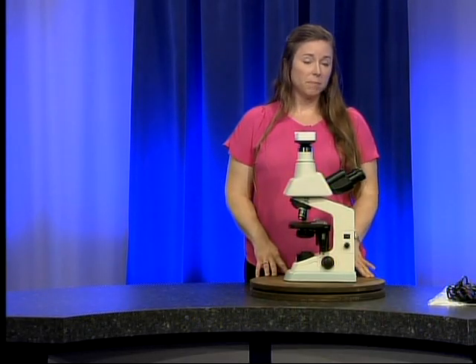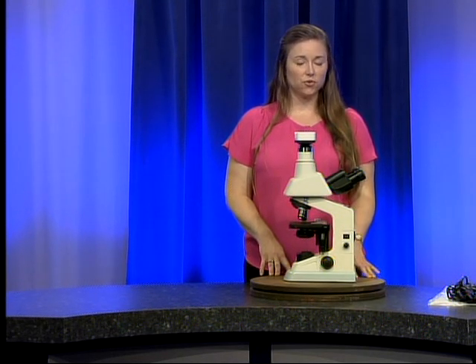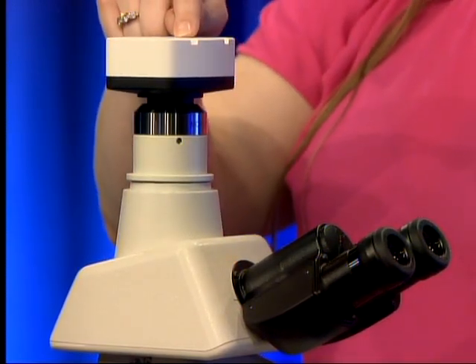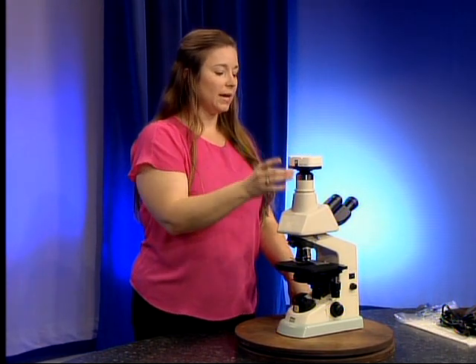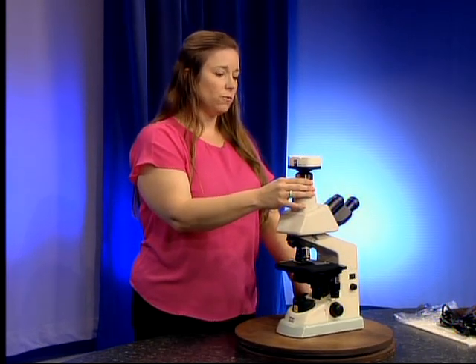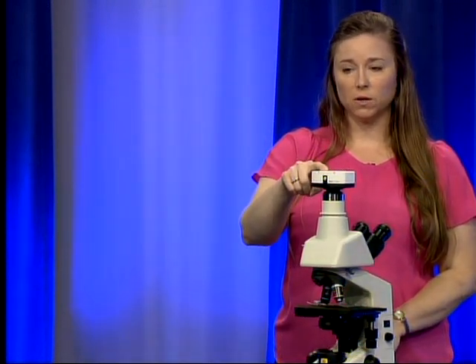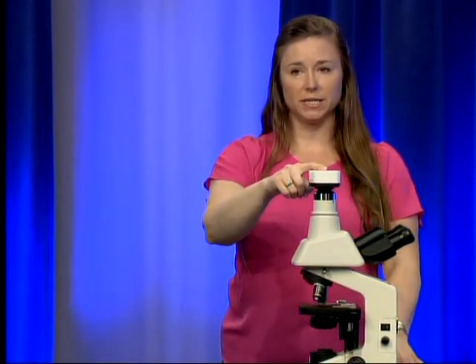This microscope probably looks a little bit different than the one you're accustomed to using in the county health departments. This is a trinocular microscope — we have the two eyepieces here that you will look through, and then we have a third ocular port that allows a camera to attach to the microscope. This is a Tuxin ISH300 camera and this is the C-mount that attaches it to the ocular port. Please do not remove this camera from the microscope, as when the camera is mounted it has to be aligned and cleaned very well, and if you take it off there's a good possibility that you will damage the threads that attach it to the C-mount.